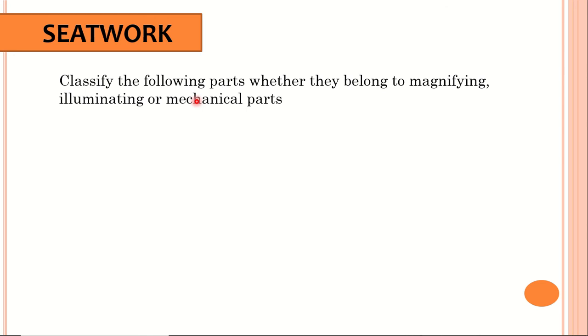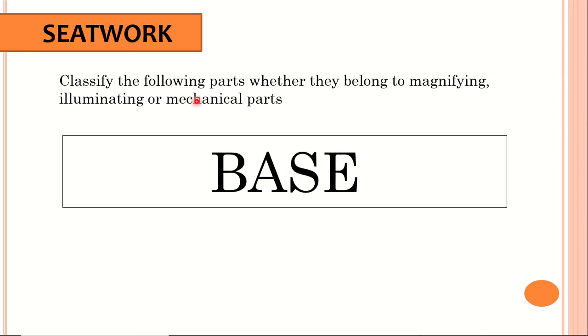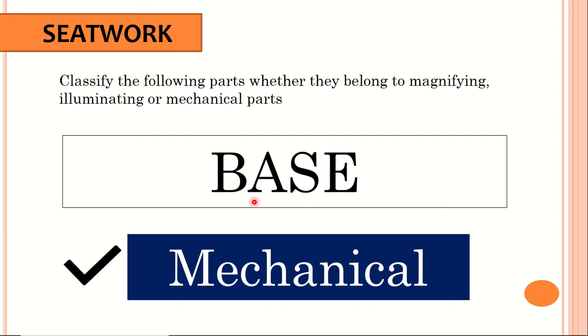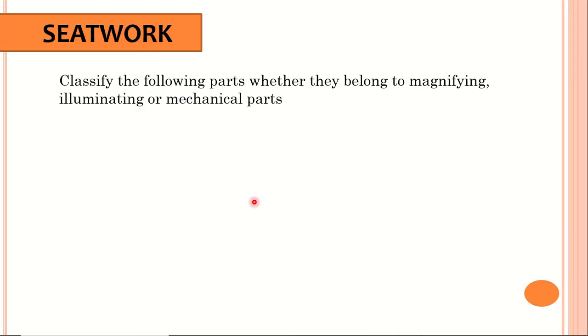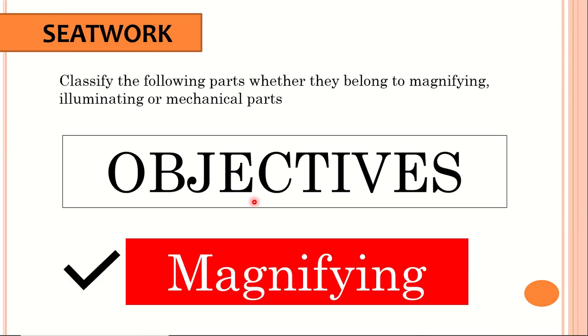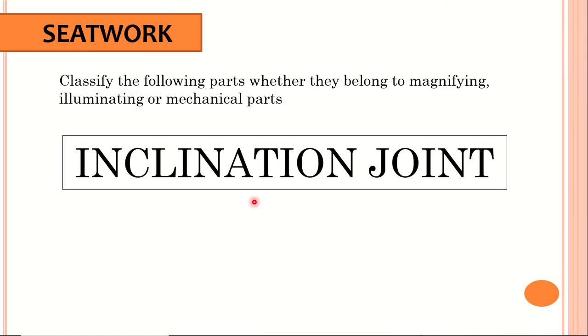First is base. What is your answer? Very good. The answer is mechanical. Next, objectives. What is your answer? Very good. The answer is magnifying. Next, inclination joint.